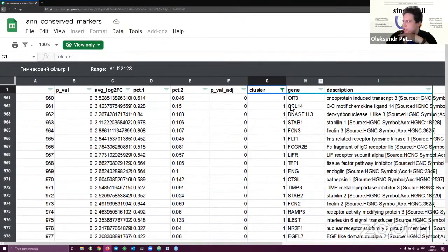And again, here you see cluster 1 and the genes checked as the most because the adjusted p-value is the least in this case. So what I ask you is to split the clusters, and I will just name a few names right now, and it would be cool if we will do the same, and then you will just tell me which cells you found. It's on you, so I will not recheck it, but I remember a few clusters, so I will be able to immediately tell you in a few cases if it was right or wrong.